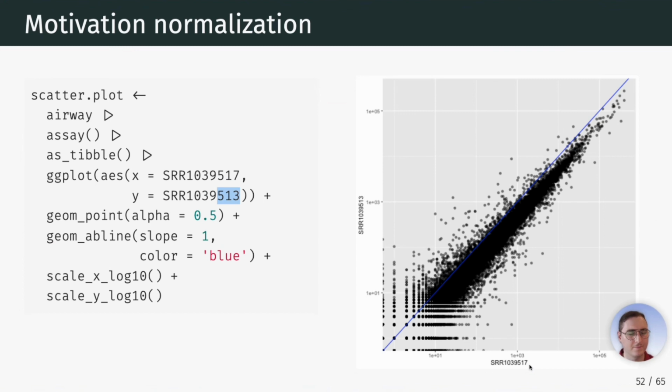And if you might remember, I introduced that differences in expression are interesting because they can maybe be the reason why we see differences in how a cell behaves with respect to a drug, a disease, environment, tissue. Let's take a step back and acknowledge we cannot compare these two libraries directly. Because here the blue line that I added is the diagonal, and we see how overall in 517 all the points are a little bit offset from it. So overall all the genes have a little bit higher expression in this library, so we can't directly compare them.